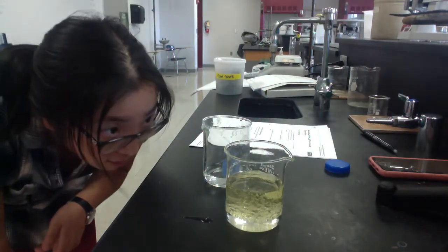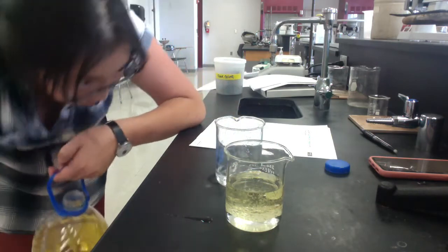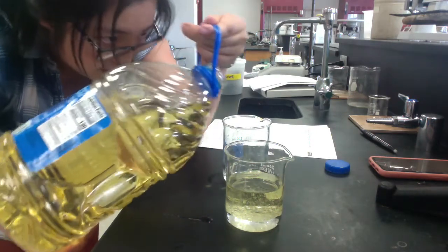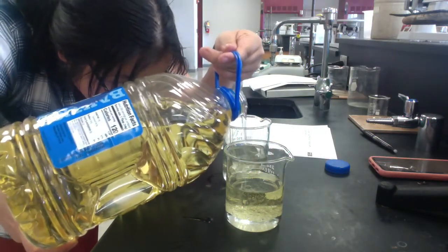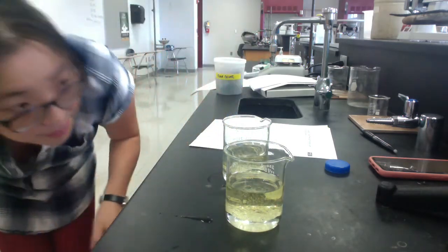I've overshot a little bit because I wasn't being super careful, but that's okay. Let's go this way and get to about 150. Okay. That's about right.